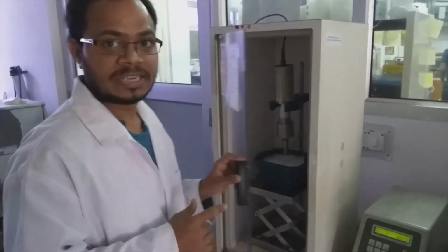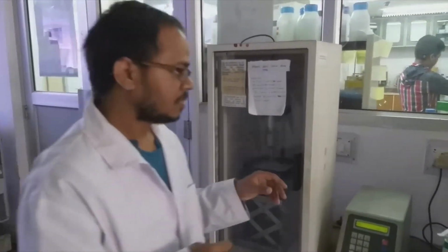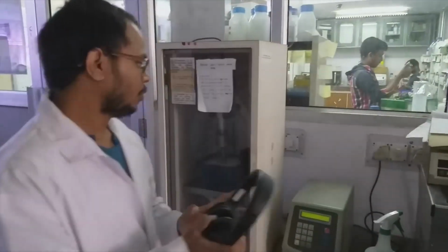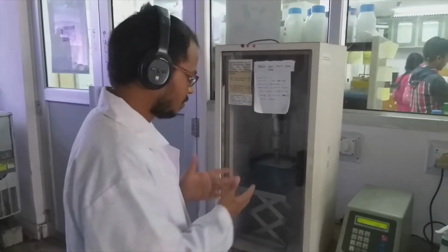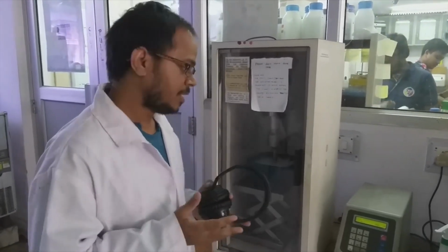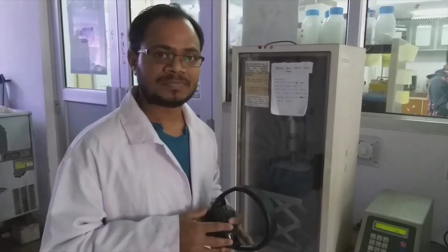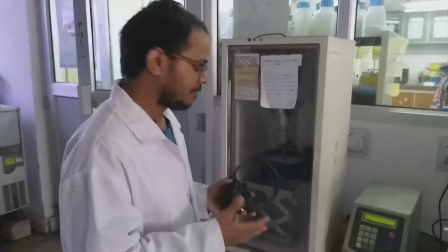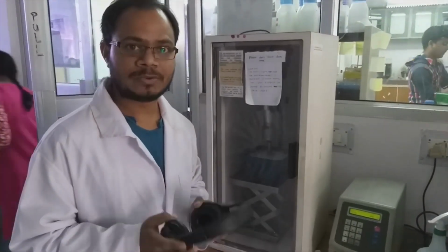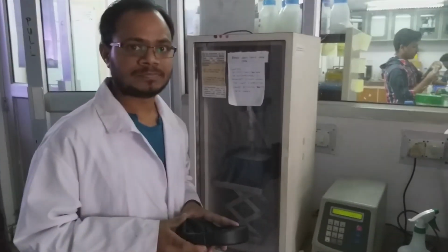So while sonication is going on, you have to properly close the door. If you are standing there, you have to use headphones, so whatever sonic waves are coming will not affect the ears. Sonic waves are very powerful, and the most affected organ in our body is the ears. It may affect internal organs also. So it is better to wear headphones while sonication is going on.